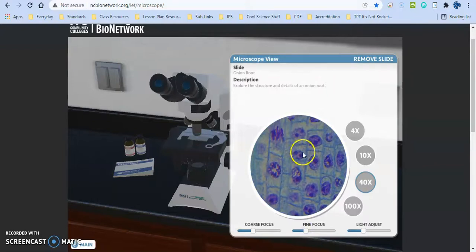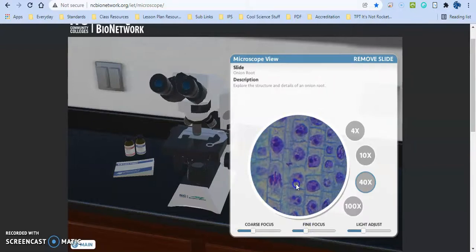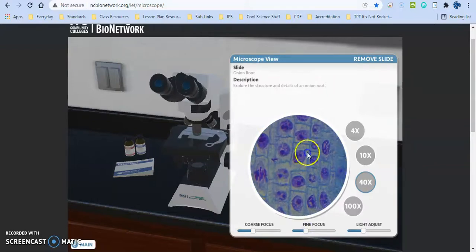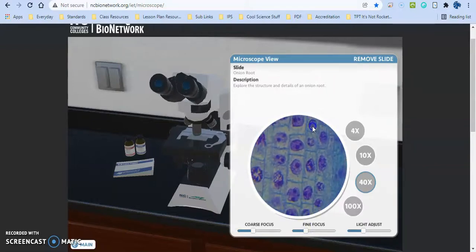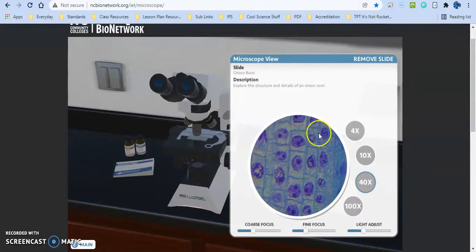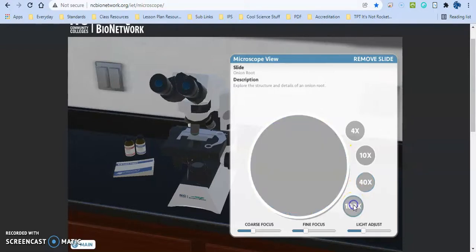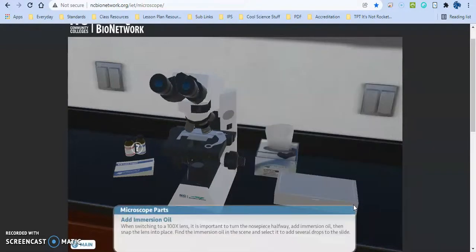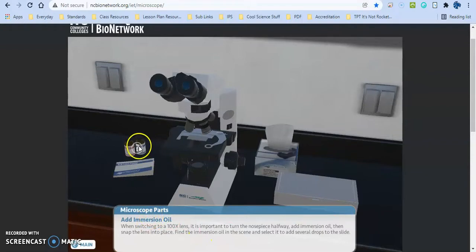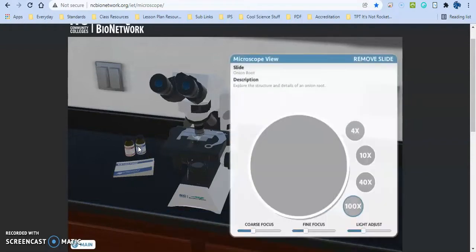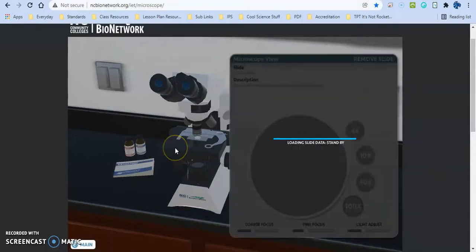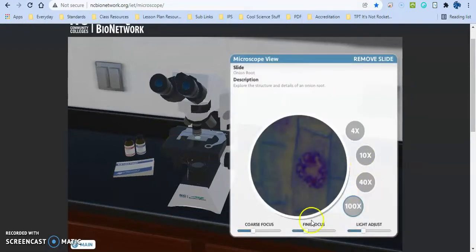They can move it around and see the different phases of mitosis here in the onion root tip. And then finally, when it asks you to go to 100x, it requires you to go ahead and add the immersion oil, which I think this is great because that's something that's really important for them to know.